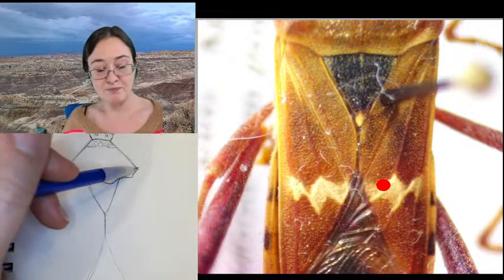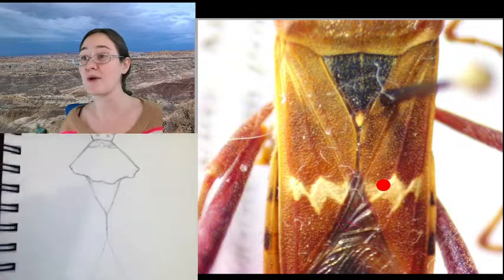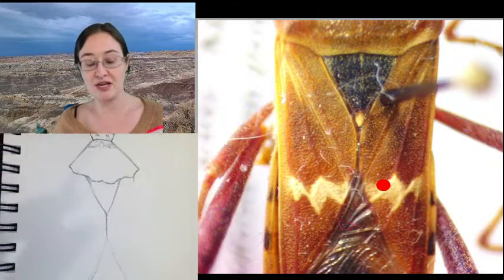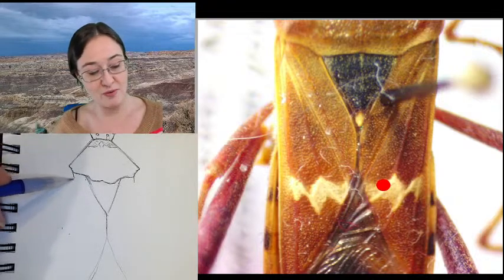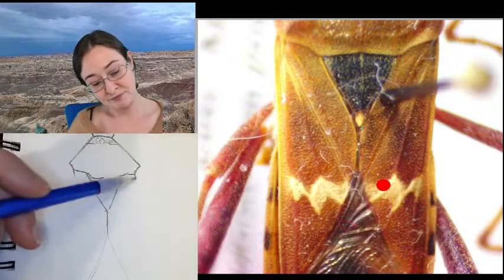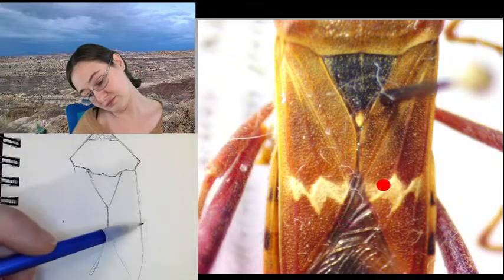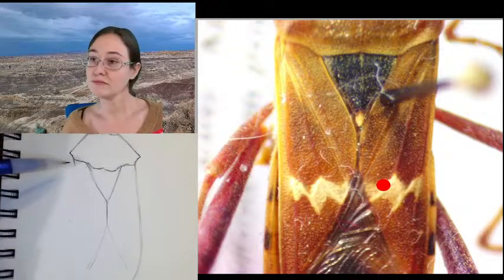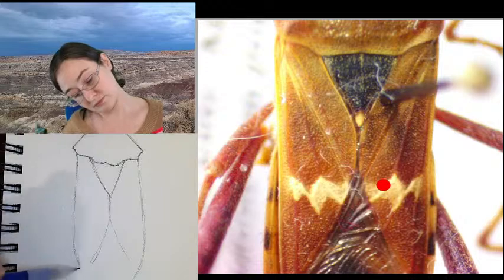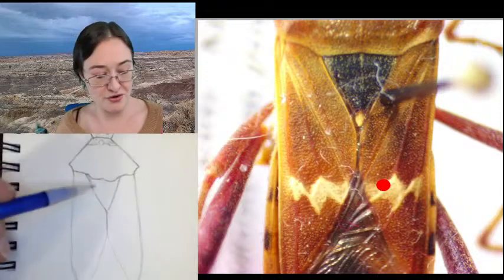All right, and then you do want to make sure you keep that spiky shoulder in there, right? The shoulder is not where you're connecting your hemielytra, or your wings, to. You want to make sure that you're connecting it just a little bit further in where the natural curve comes. Okay, so we can't see much further than that right now.